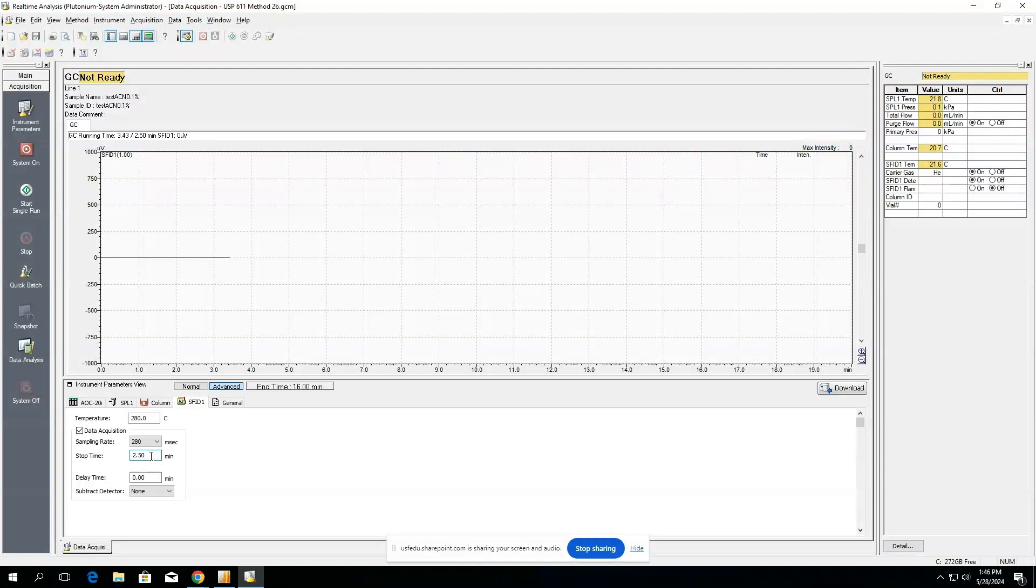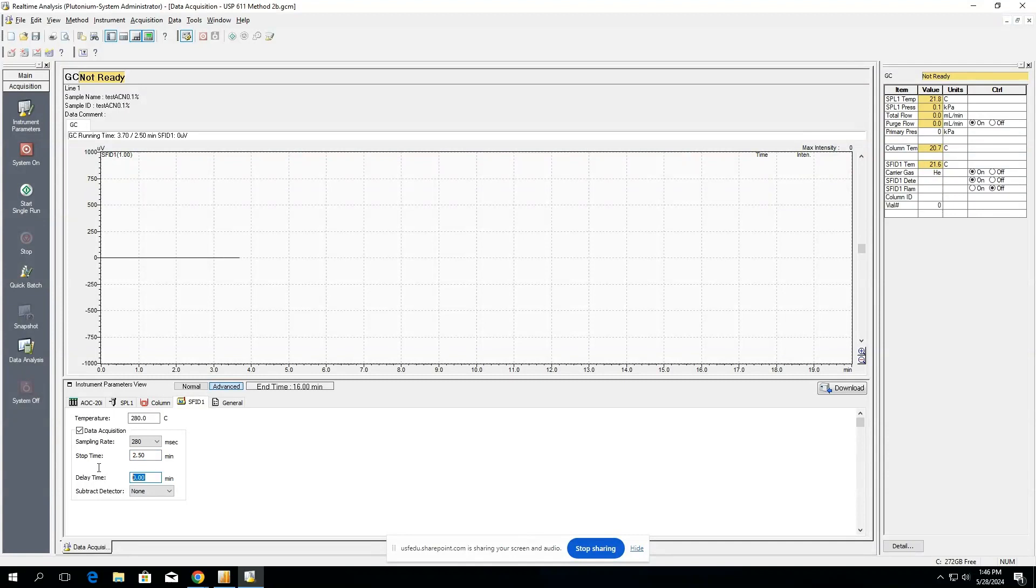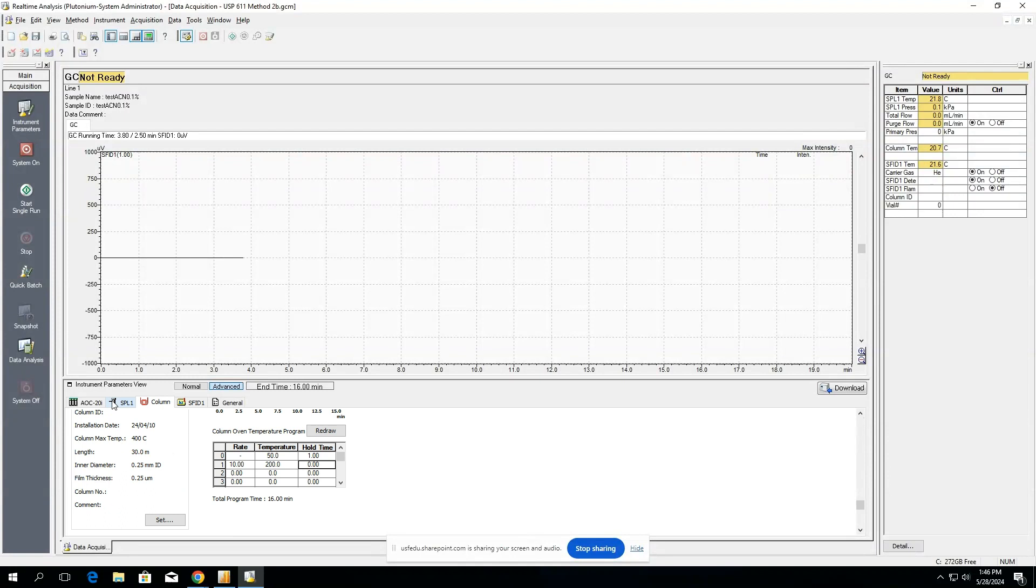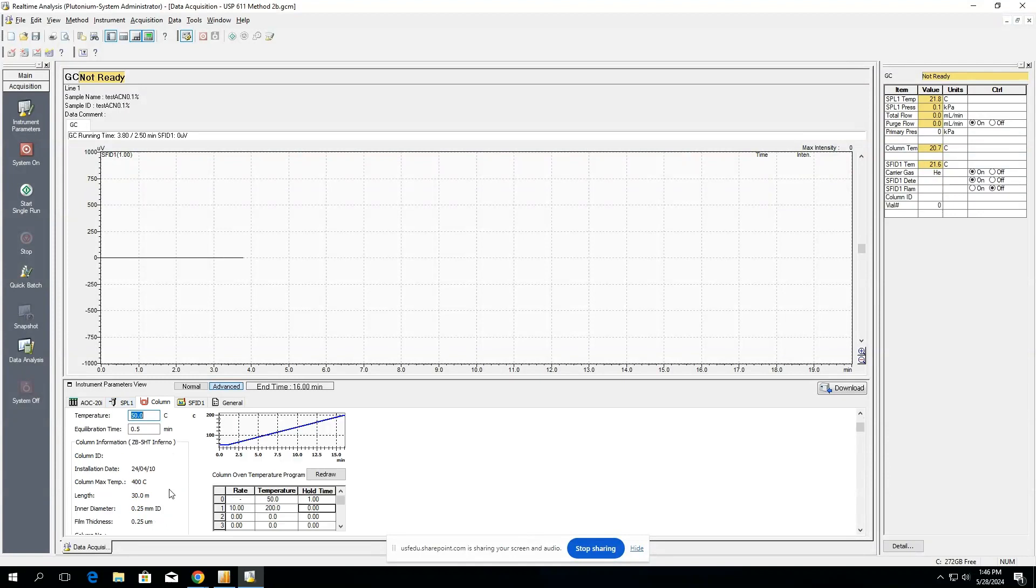And then if you aren't sure about whether or not the column's ready for another injection, you can always add time to this, and this will delay time until the next injection. So in other words, when you make the batch and you start everything, this time here is the forced time between the end of the stop time and the beginning of the next injection, which is where your equilibration time begins.